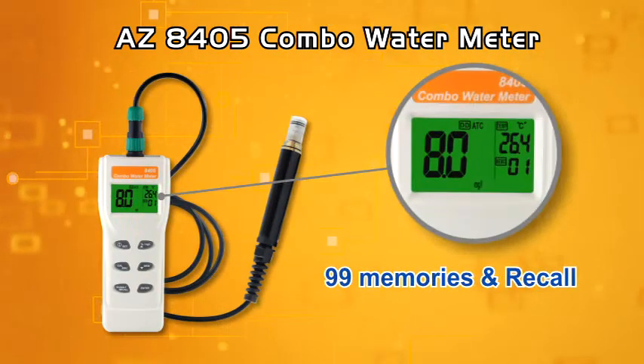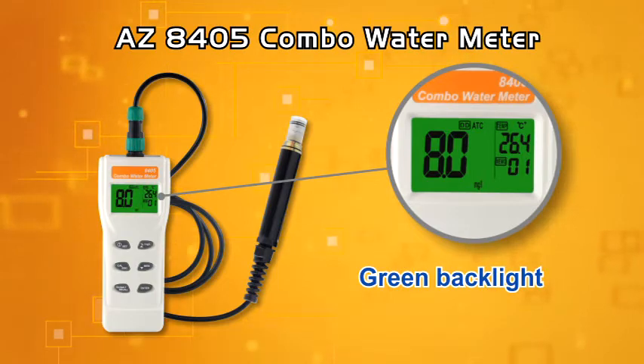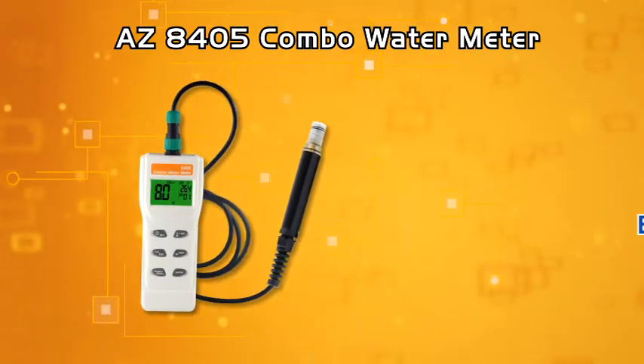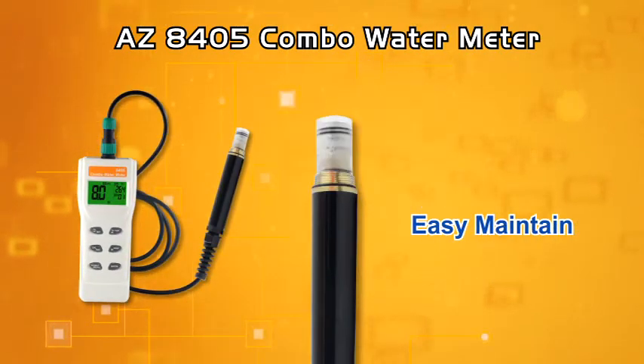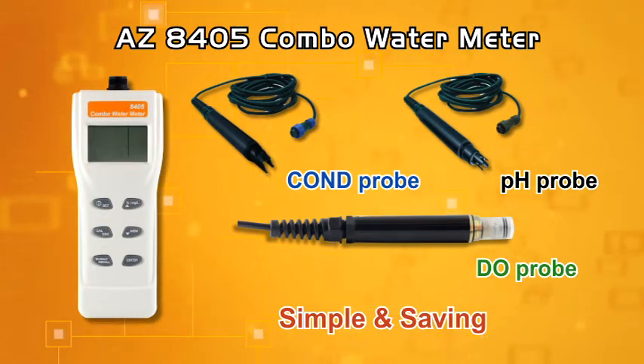99 points memory saves your recording effort. A green backlight helps you work in dark environments. And unbelievably easy to maintain. A simple, budget-saving and accurate dissolved oxygen probe you've never experienced before.